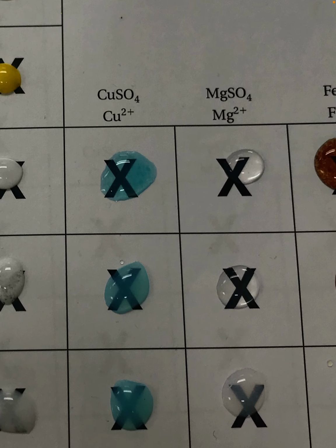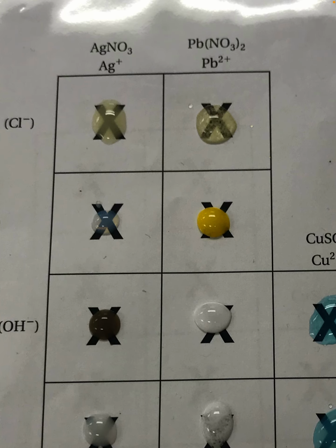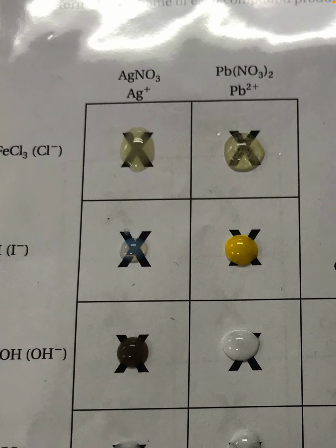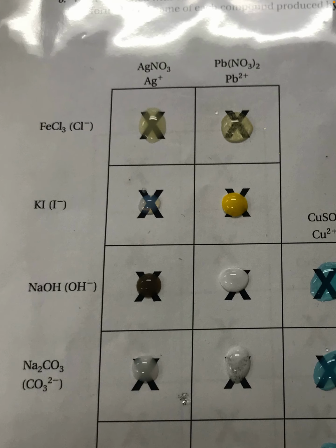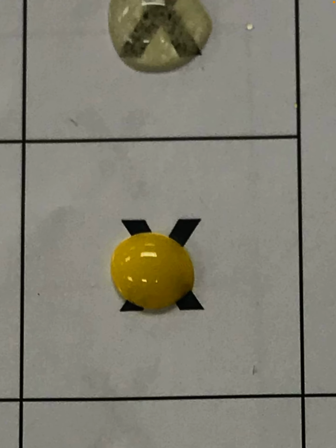And what we're going to do is go through and describe the reactions. And I will give you the official designations. Some of them were described as tan. For example, this one here. I could see that. Brown. Depending on your source, this is described as yellow, or I've seen it more frequently described as canary yellow.